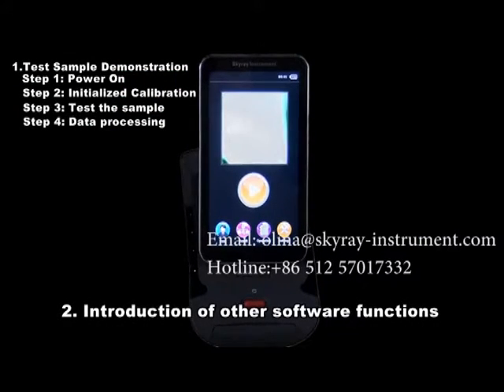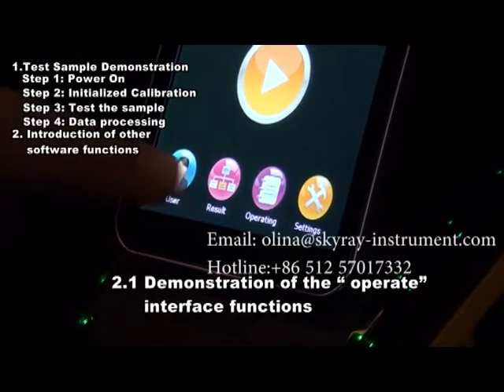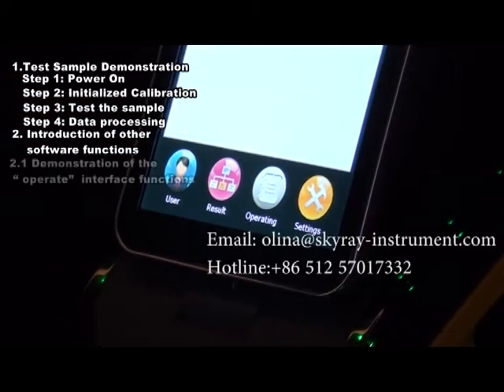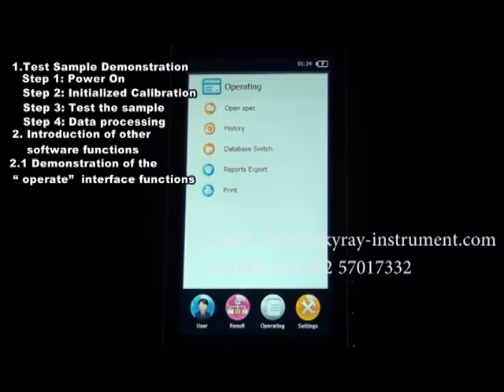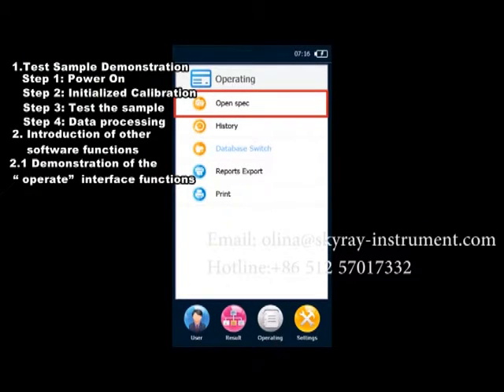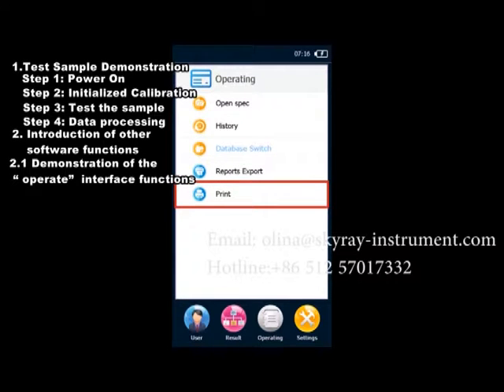Introduction of other software functions. Section 2.1: Demonstration of the Operate Interface Functions. On the main interface, click the Operate button and you can see options such as Open Spectrogram, History, Database, Switchover, Report Export, and Print.